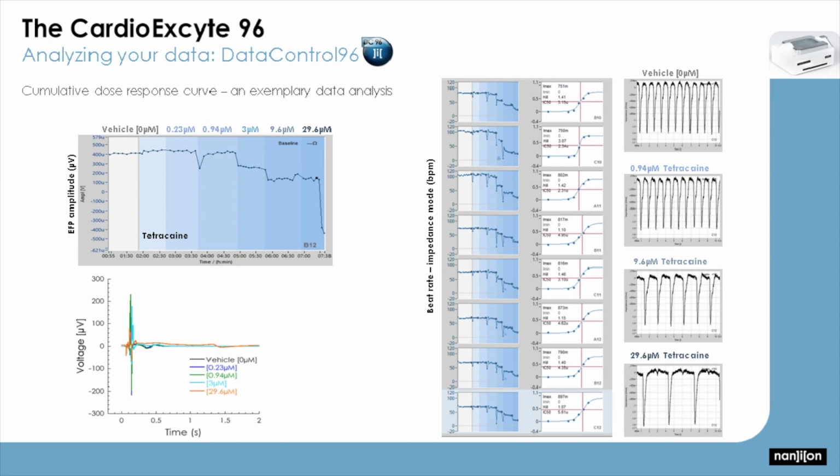When analyzing the data, we have a really nice software part which is called data control. On the left-hand side, for example, you see the EFP spikes, the sodium spikes, in the presence of control and increasing concentrations of tetracaine. And on the right side, you see a sample IC50 recording of these tetracaine measurements. In principle, with data control, you can pick any parameter that you like and calculate either IC50 or EC50, or also percentage of block.